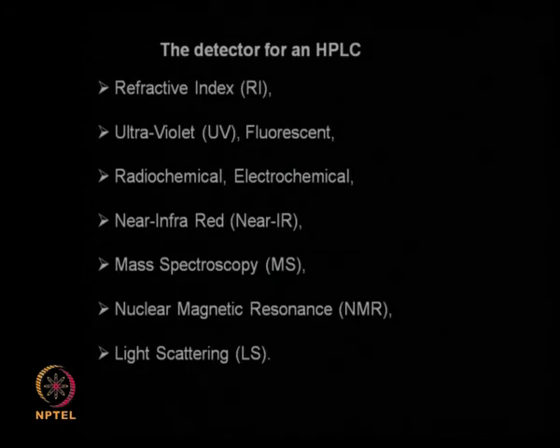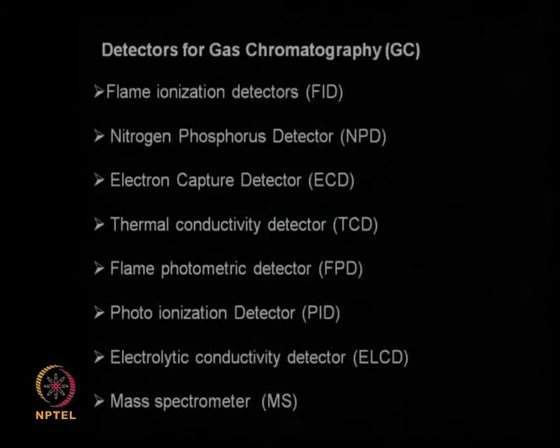So, a wide range of detectors can be used depending upon how the solute behaves, whether it has a fluorescing capacity or whether it gives out a large mass value, or whether it responds at the ultraviolet range, and so on actually.